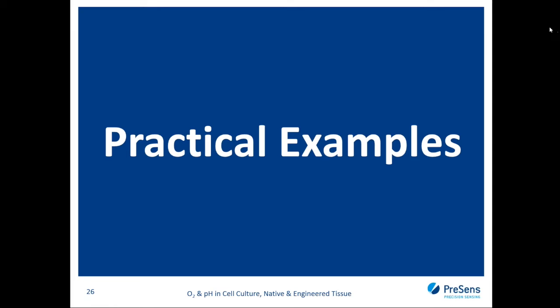There's one question just related to the software. You mentioned that you can stay at home during the weekend and the system is working. I guess the question is, can I also be at home longer? How long can you have that time-lapse video, or how many pictures can be captured? Actually, you can define, this depends on the interval, how often you take the images.